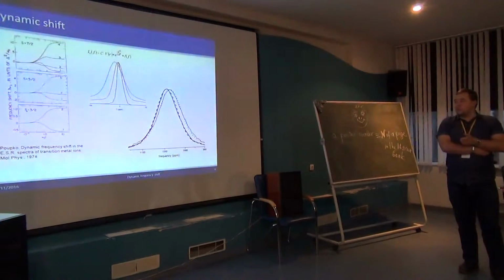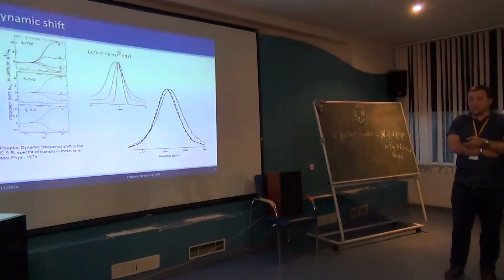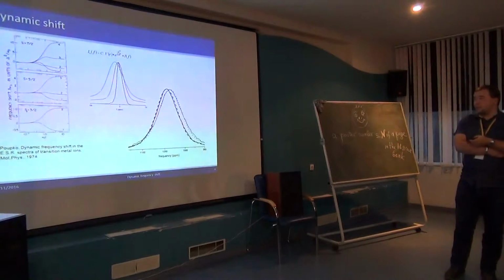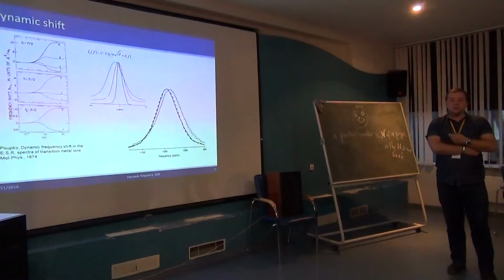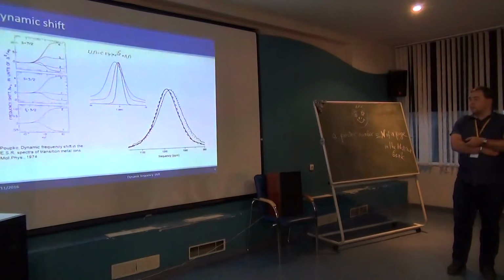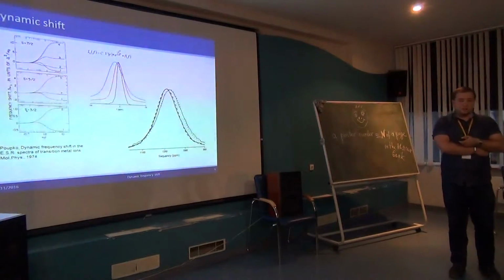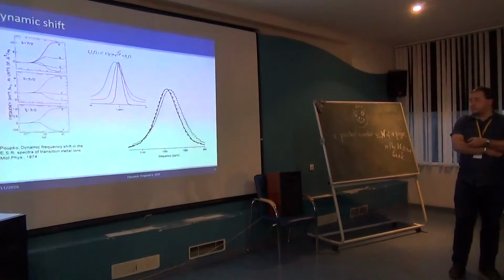Actually, in order to do so, we should solve one more technical problem. It is to determine different contributions to the line width, because there is not only a contribution from dynamic effects, but, for example, a contribution from a non-ideal distribution of pore sizes. This distribution was calculated using information about the pore size distribution and the dependence of Knight shift on pore size, and this contribution is expressed by the black line.